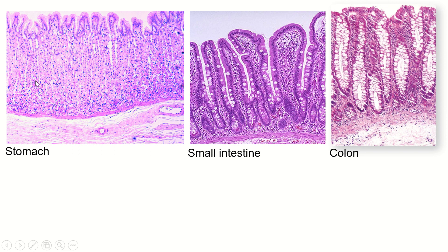Now comparing stomach, small intestine, and colon: notice first of all that the mucosa of the stomach is absolutely huge — this must be at a much lower magnification because we can barely see the individual goblet cells. This part is maybe about the same size in all three, but the mucosa of the stomach also includes all of these gastric glands.